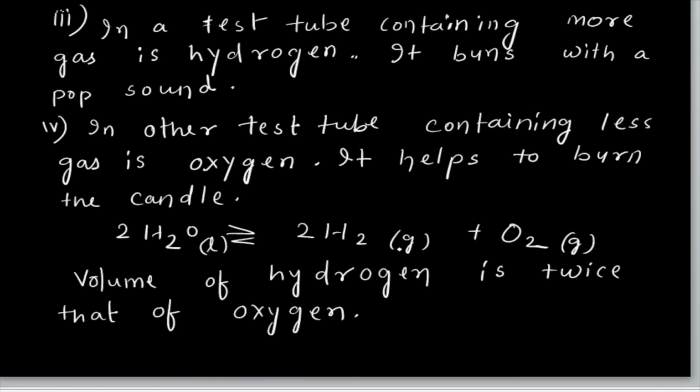You try burning it. Then the gas, which is hydrogen, in the test tube burns with a pop sound. Pop sound means a very soft sound that will not disturb anybody. That is called a pop sound.